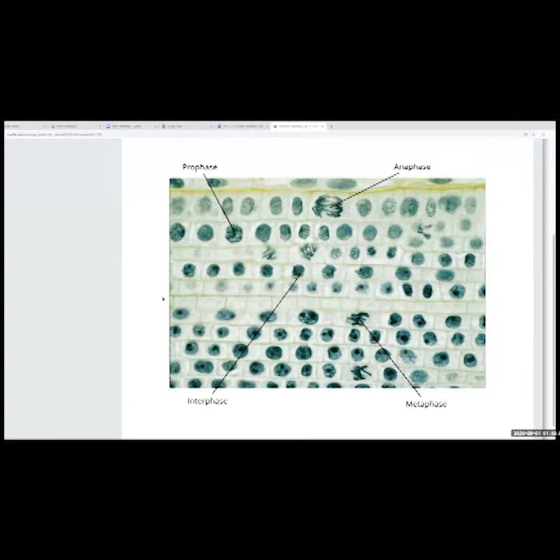You're doing your section, and some of the sections aren't going to show the whole cell. You've got to remember, it's a three-dimensional object you're putting on a two-dimensional field. Because you can see how light these are here, and how dark these are above it, and how dark these are, how light these are here. It all depends where the nucleus is, where you do your slice.